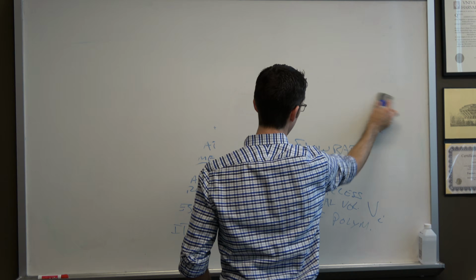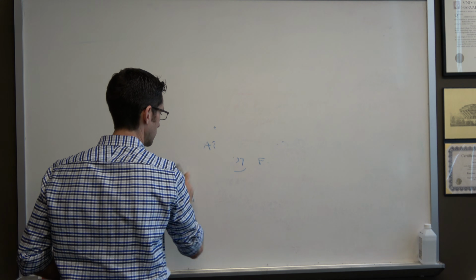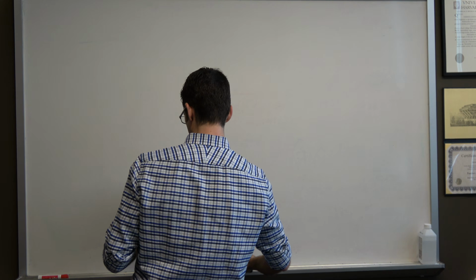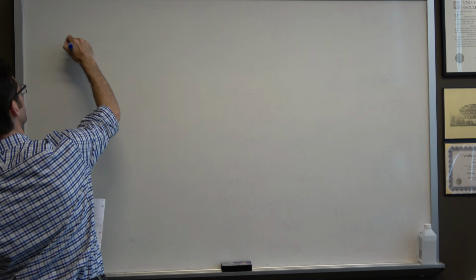So then we have a modified equation for the retention volume.